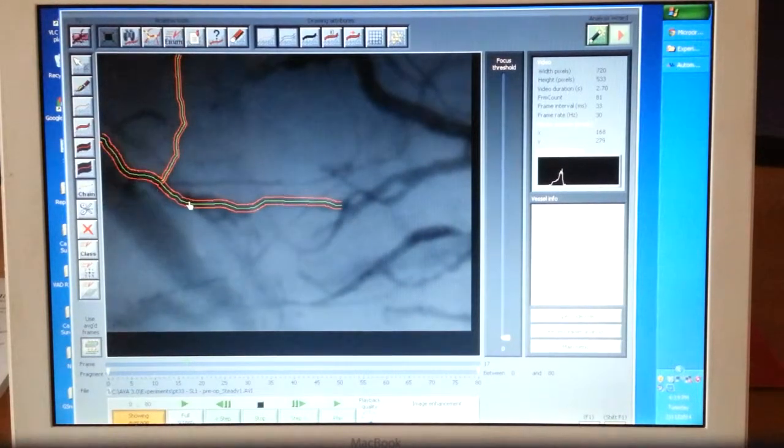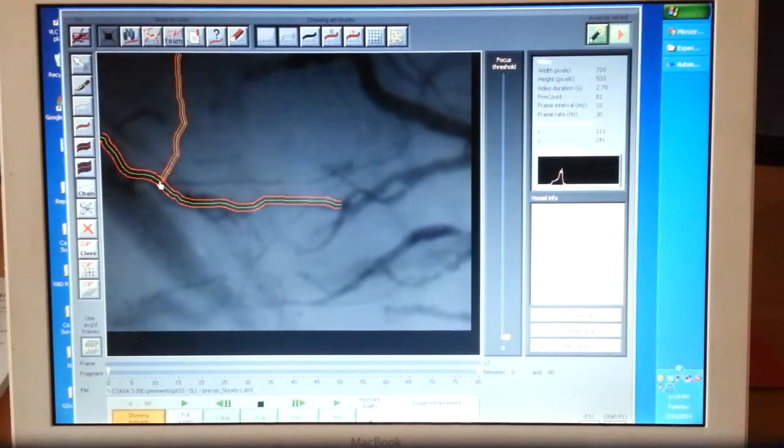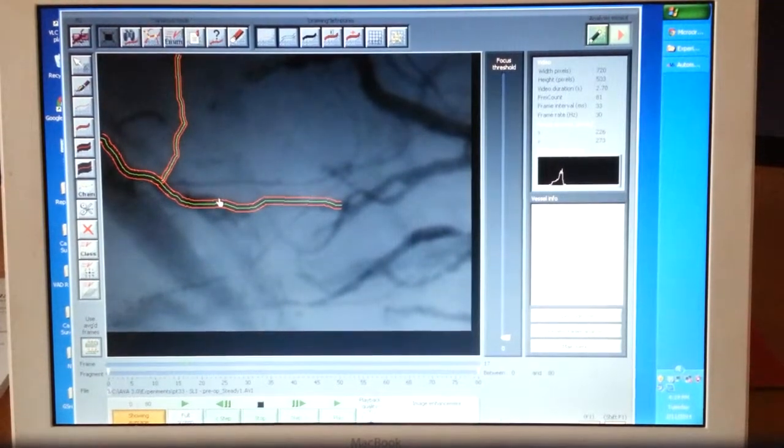And once you click on it, boom, you'll see the little gap has disappeared. Now, don't worry too much about the fact that this vessel here connects and doesn't connect into there. It's okay. It's not the end of the world. Just leave it like that. Now, basically, once we have that chained, we can continue doing our analysis here.